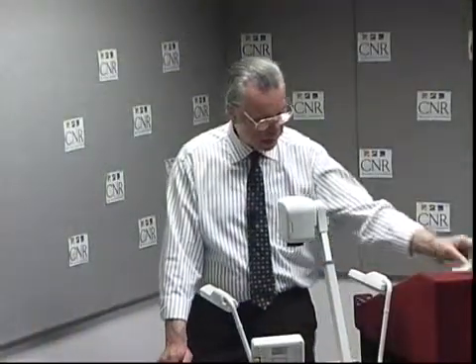There are 16 dots here, of which you can only see about 4 on the image. And they are arranged inside of a square that is 30 millimeters by 30 millimeters. This is intentionally done so that the cameras can acquire the image.